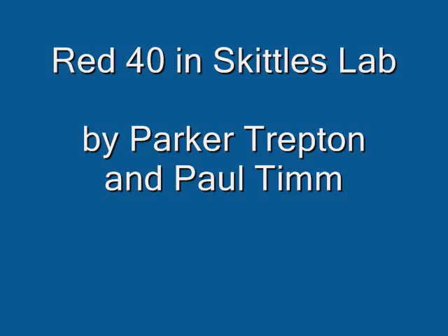The purpose of this lab is to see if there is red 40 in Skittles. The independent variable is the color of the Skittle, and the dependent variable is the RF value of the red, if there was any red, in the red, orange, yellow, green, or purple Skittle.